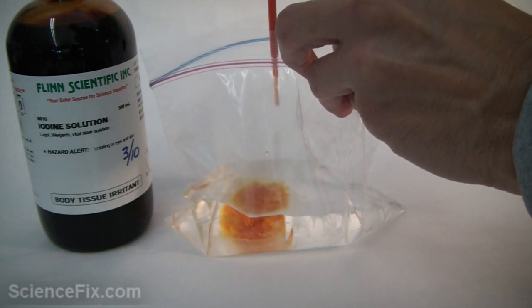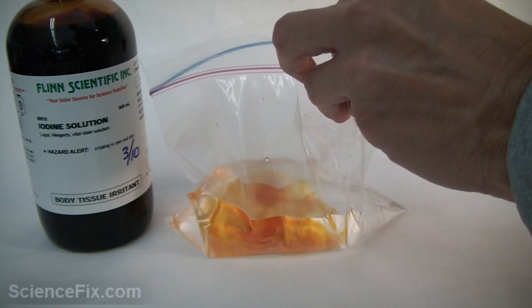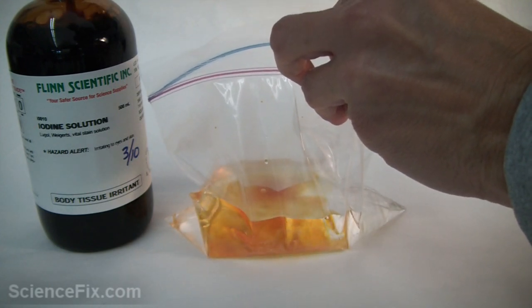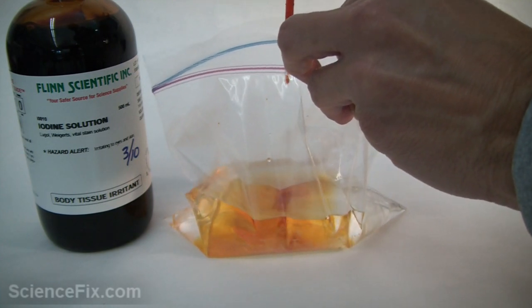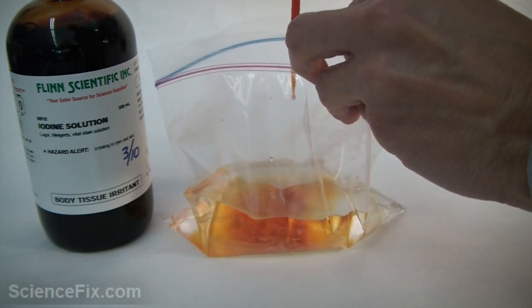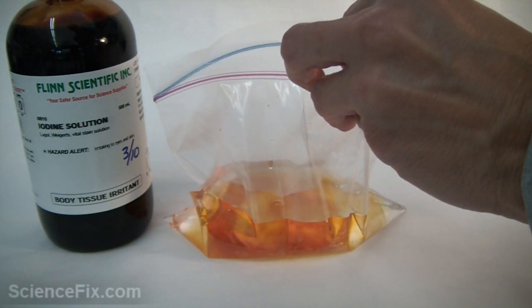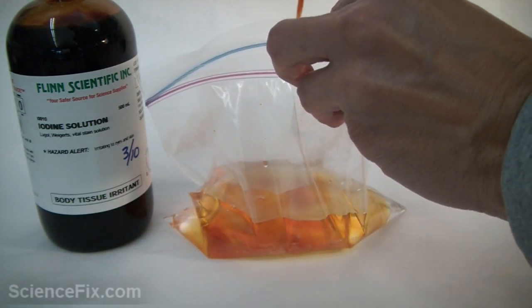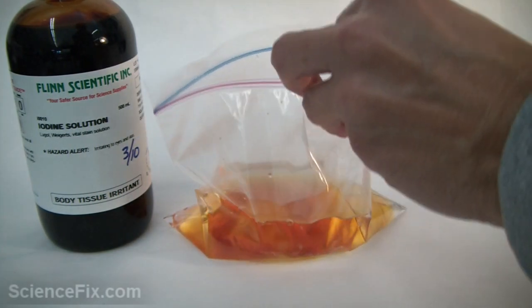We are going to put enough iodine solution so that the water turns a darkish yellowish to slightly light brown color. You can't have too little because this demonstration won't work with too little iodine, and you don't want to use too much because that would be a waste.